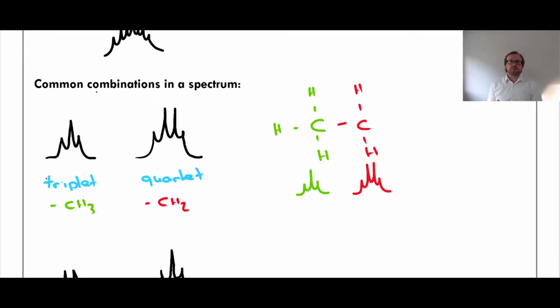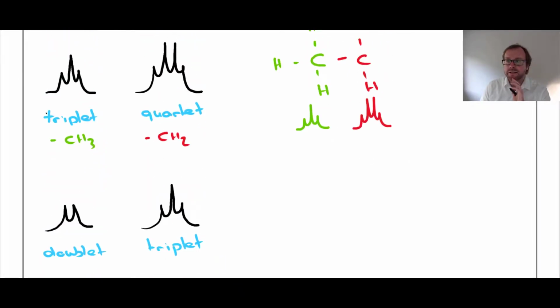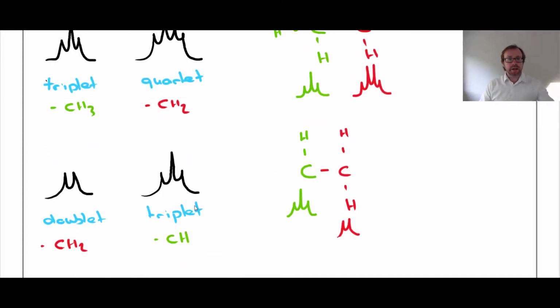Okay, this is where students start to get confused a little bit. So you have to remember that you're looking at the adjacent carbon. Okay, the adjacent carbon. Okay, right, so I'd like you to have a go at trying to do the next one to yourself. Okay, I think we'll do the last one together actually. So in this example, I hope you managed to do this one.